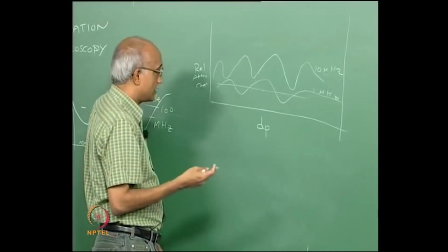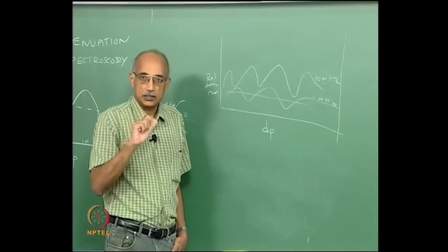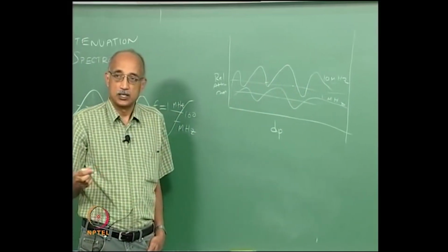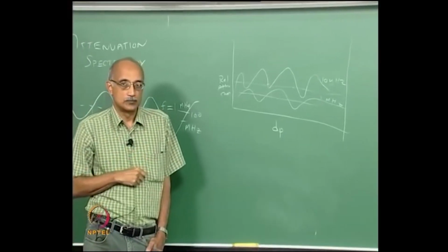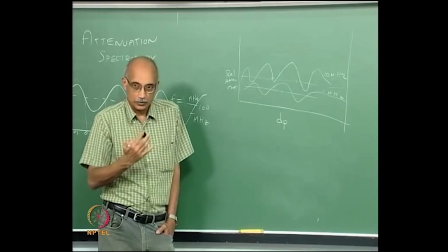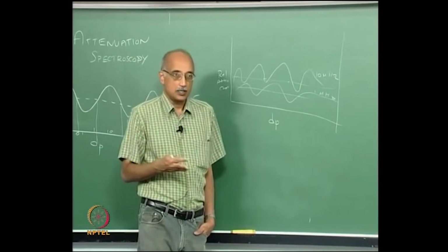So, because of that, in principle, if you just test at 2 different frequencies and look for the one common diameter that is detected at the 2 frequencies. In other words, when you look at the possible sizes corresponding to the second frequency, in principle there should be only one size at which there is convergence between these two. That is assuming absolutely no measurement errors and no possible intrusive effects that can affect your sound transmission and so on. In practice, it is not possible, and that is where the spectroscopic technique comes into play.